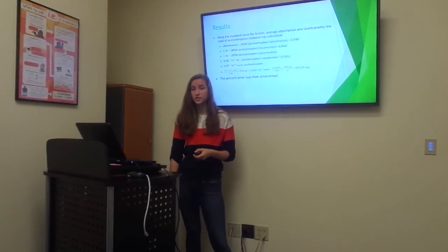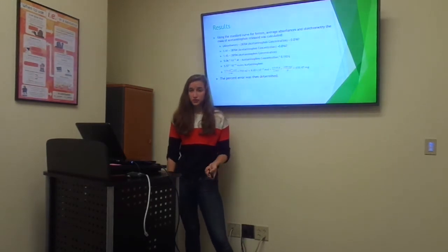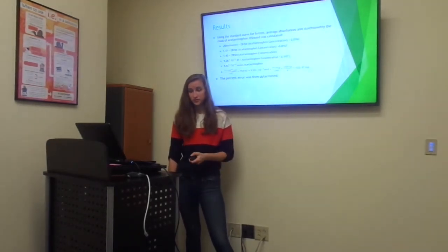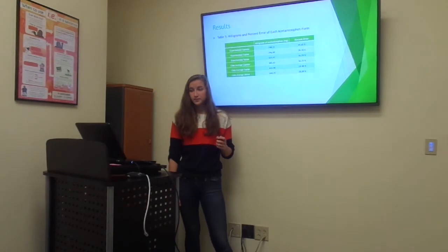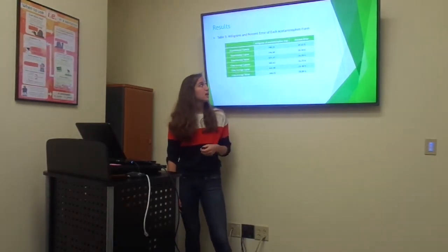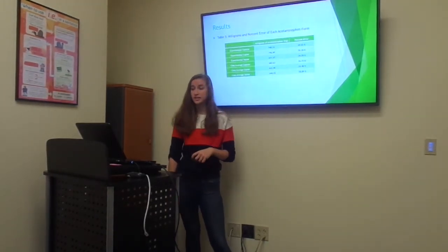This is going to be used in comparison to the 500 milligrams theoretical for all three forms to find the percent error of each of the 6 samples. As shown in Table 5, all of the percent errors and the milligrams released of all 6 forms.